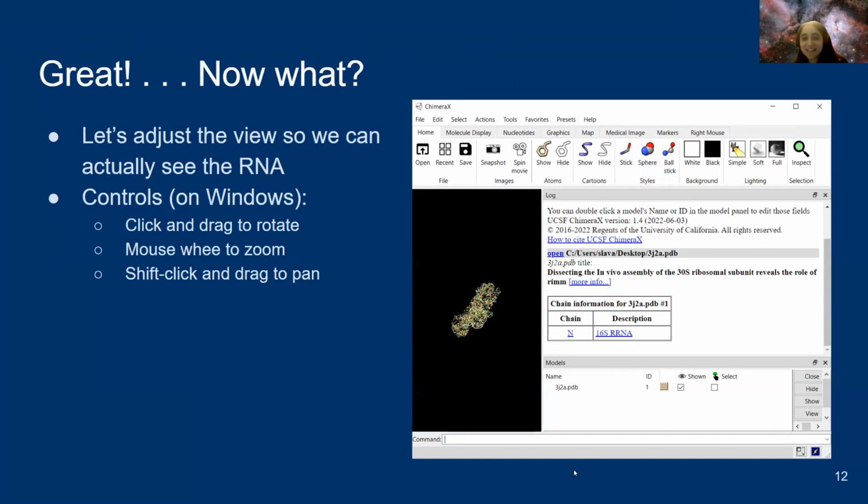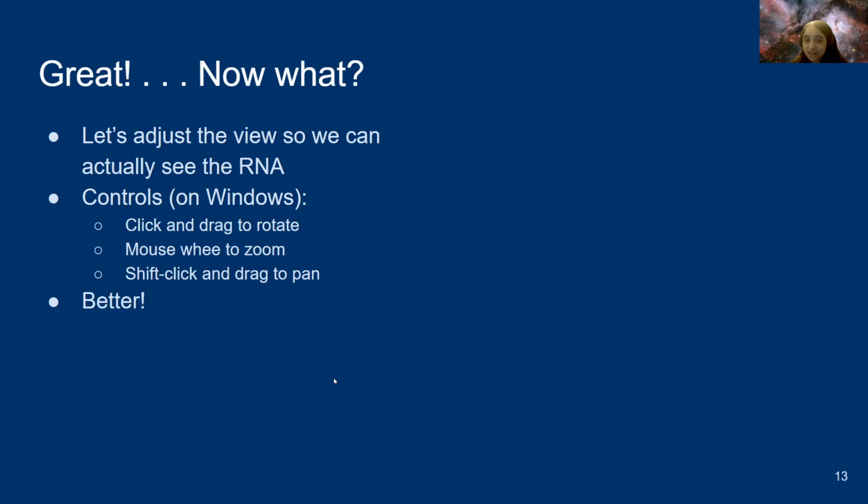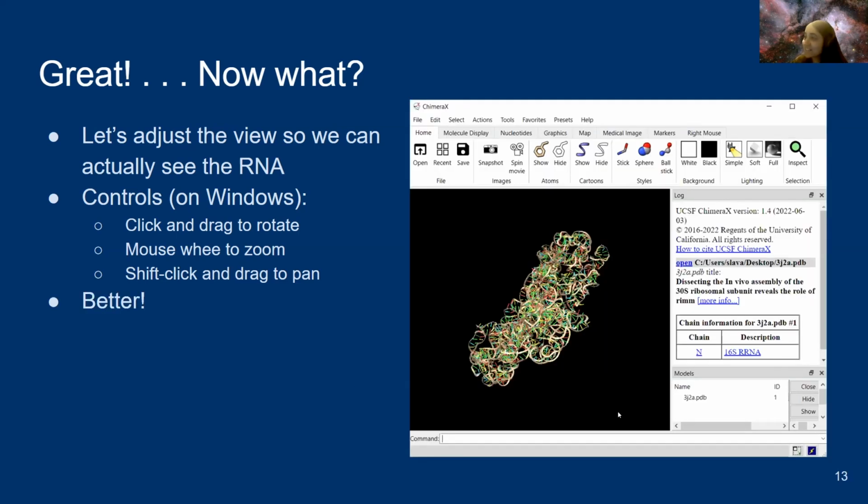This is great. This is exactly what it looked like when I first loaded it. So what I did is I adjusted the screen size, zoomed in a bit so I could actually see the structure. And that's what it looks like right when you load it in. Cool. Except right now, the visuals, it's a lot to look at, right? I'm trying to find this specific base. How can I find this specific base in this big, giant jumble of things?